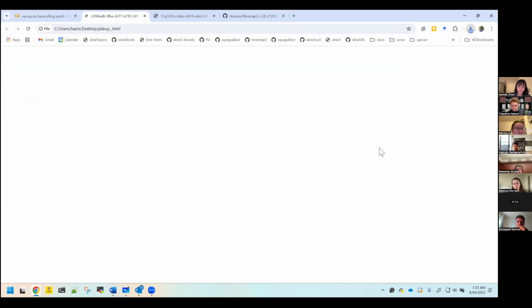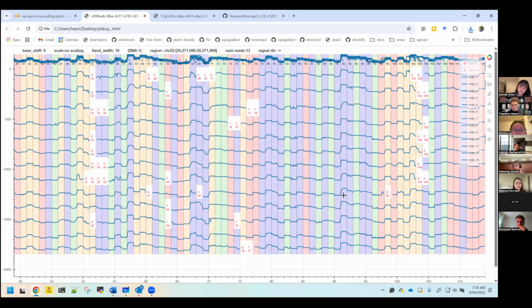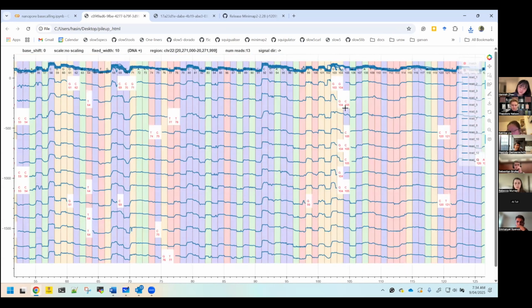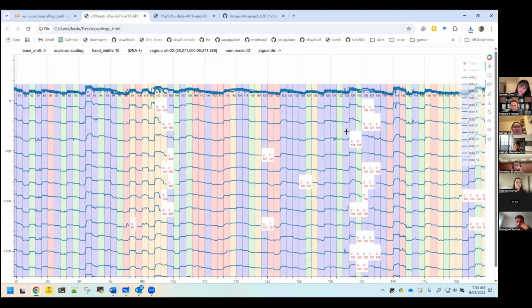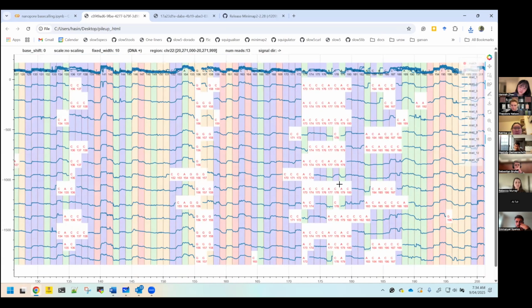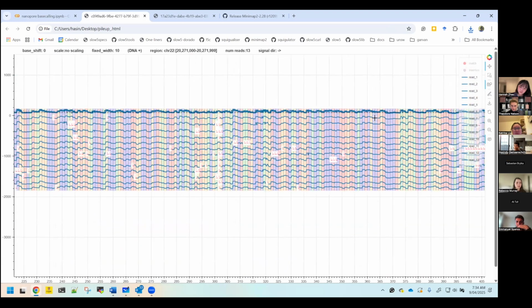That's a huge one. So, okay, this is what it looks like. For a given region, a number of reads are aligned. You see, they are quite similar, multiple reads, if you look at the pattern. And here and there we see some deletions, insertions, and those kinds of things. This is how it looks on top of each other. Not perfect, but quite close enough. And some regions are pretty messed up, the alignment. Yeah, and it goes on like that.